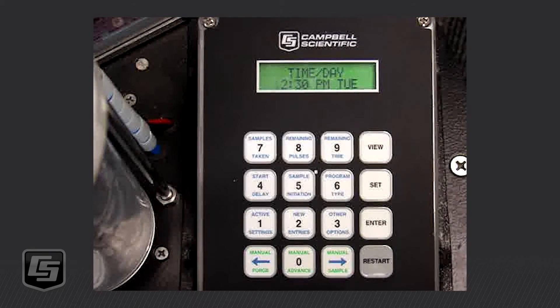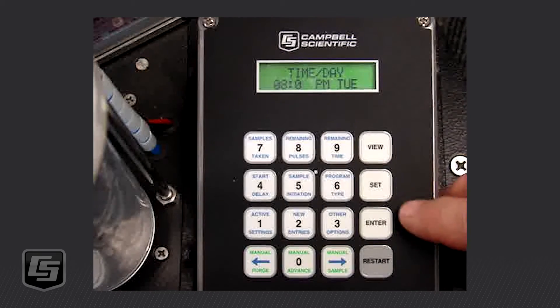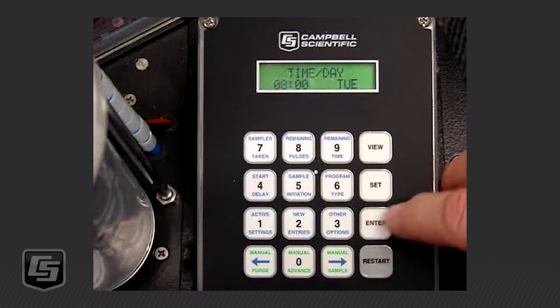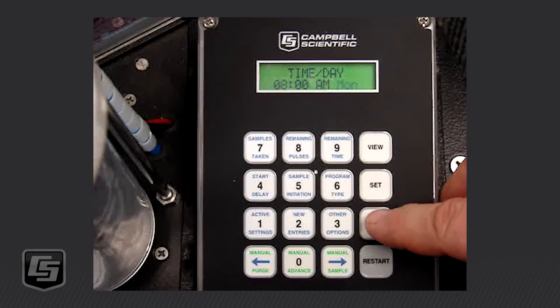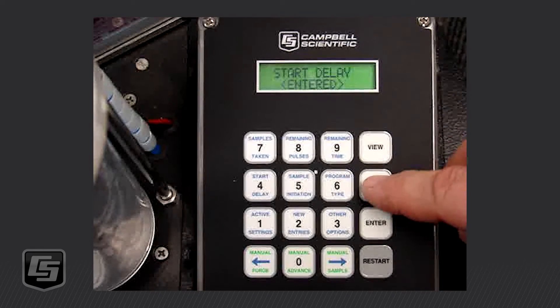We want to do Time and Day, so we press Enter. Let's say I want it to start on Monday at 8 AM — so I'm going to enter 0800, press Enter, which moves it to the AM/PM field, and I want to change it to AM. Press Enter again and I want to move that to Monday so it will begin on Monday at 8 AM. We press Enter and that has been put into the controller.